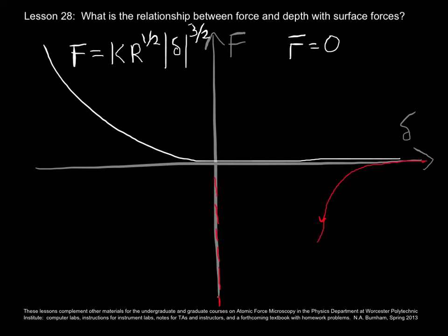And as those outermost atoms are coming into contact, the attractive force still grows because the tip is getting nearer and nearer to the bulk, the semi-infinite half-space of the sample. And then, as you would expect, the repulsive forces start to grow, and the sample turns around. Rather, the cantilever turns around.